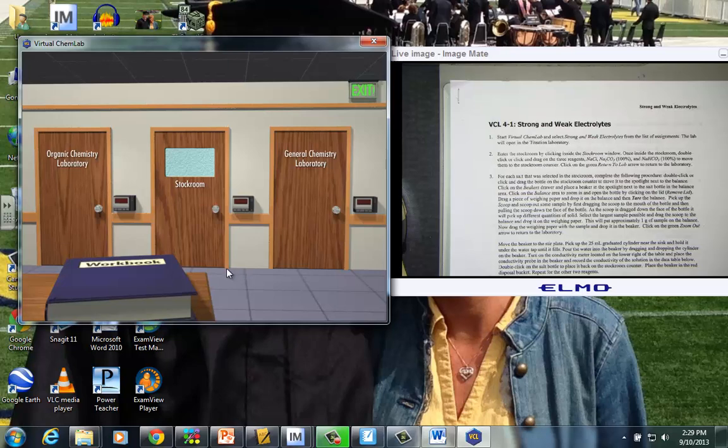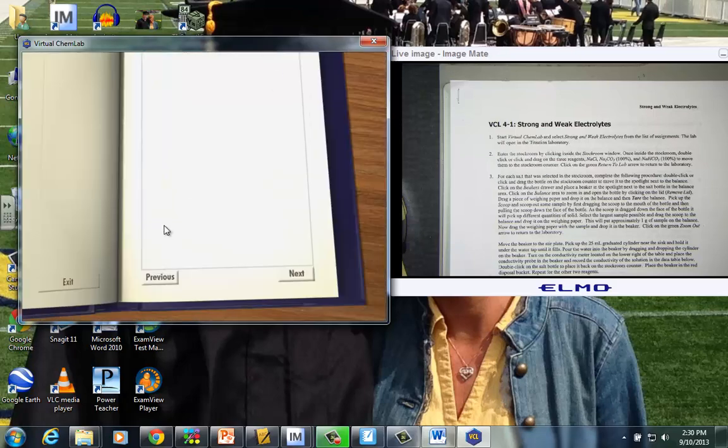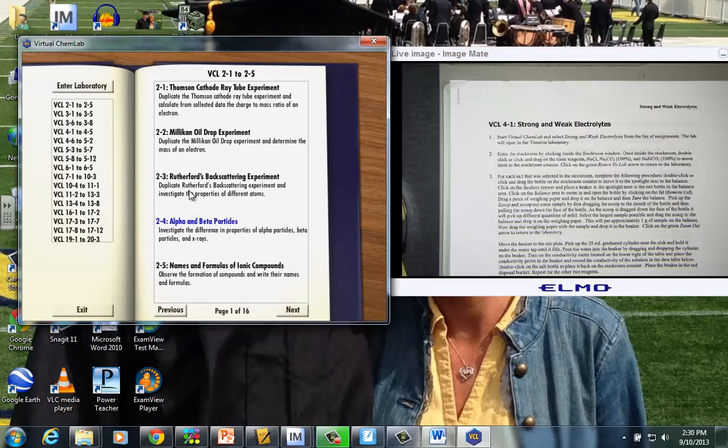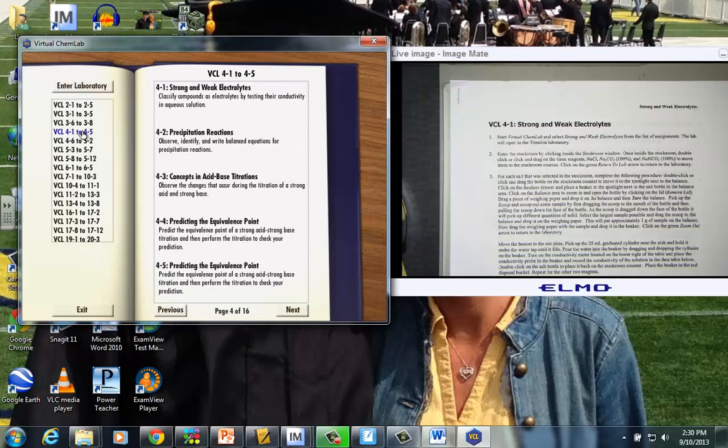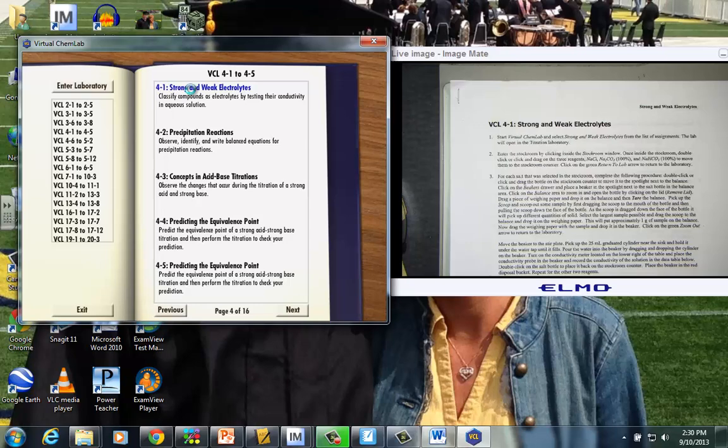One of the easiest things to do to find the correct place in the chemistry lab is just to click this workbook and just kind of leave it open. Over here on the left-hand side of this page, you'll find the virtual chem lab, VCLs, and I notice that we're being assigned 4-1. Strong and weak electrolytes matches the title, so this is the one I'll click.